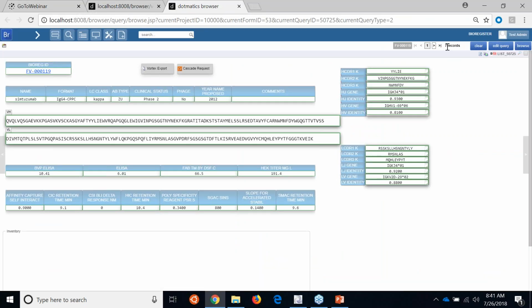So now I have those 7 sequences that I've refined, and perhaps here I want to submit these sequences to my colleague to run some follow-up assays as well. So this works by directly exporting, and visualization templates get applied automatically.